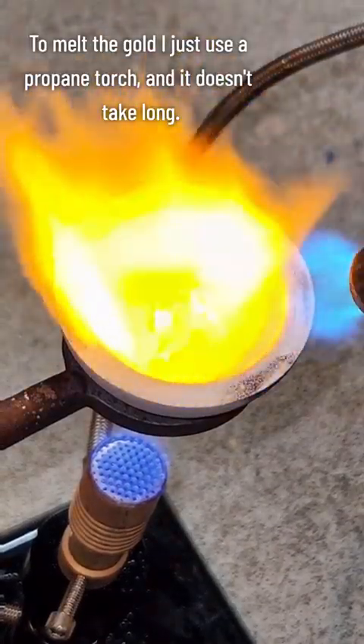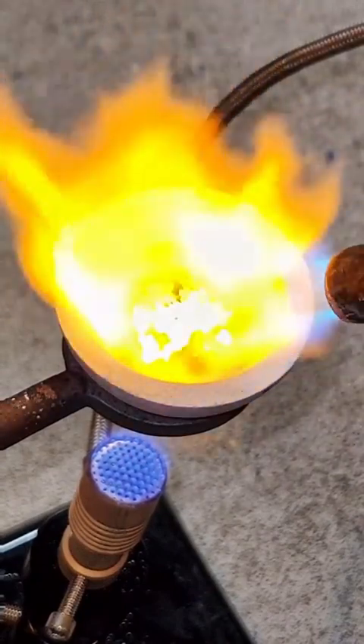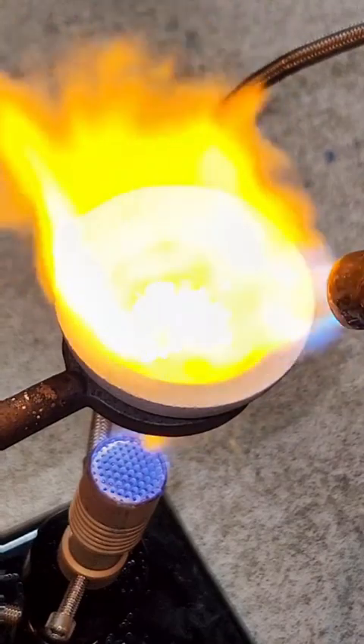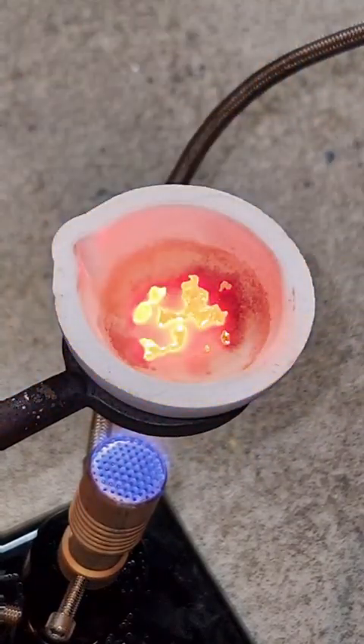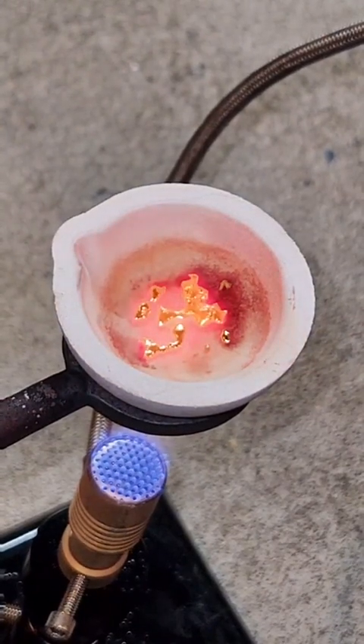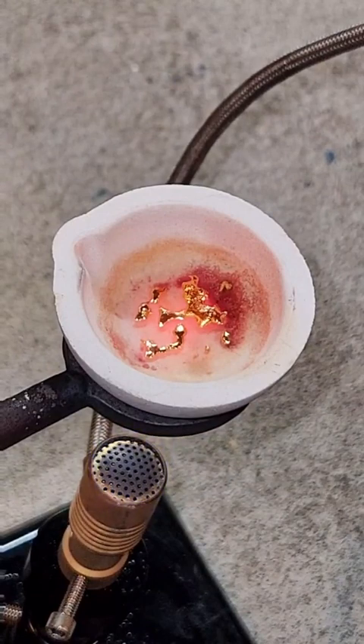The liquid gold is allowed to cool for a while and the resulting product is upwards of 99.99% pure. This extreme level of purity isn't ideal for jewelry, as pure gold is kind of soft and the resulting product would deform too easily. However, for chemistry, I want it to be as pure as possible.